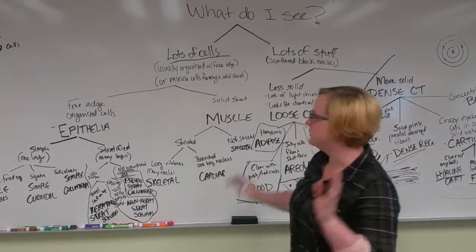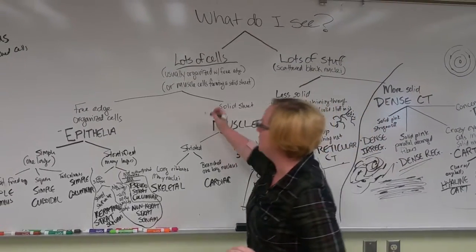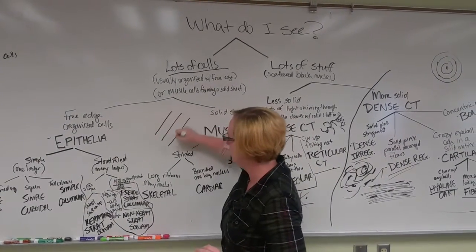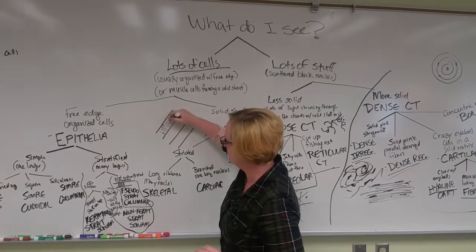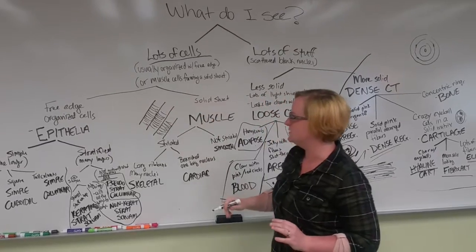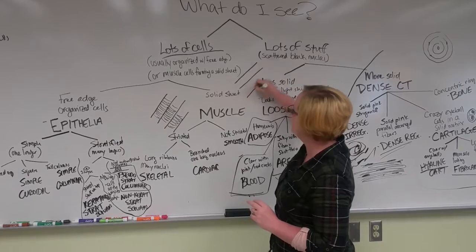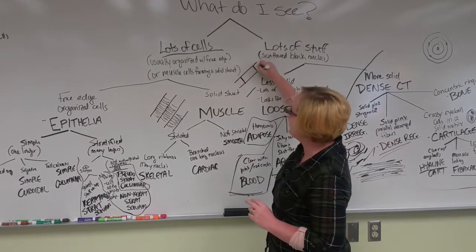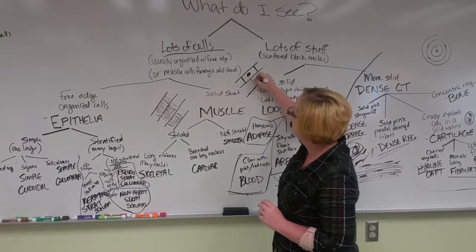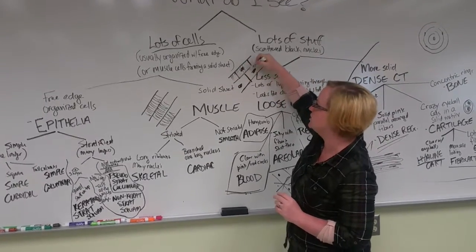For example, you could look in a microscope and see something that's very solid in pink color, but clearly divided cells from one another. You'll see clear ribbons like so, with striations that go across, like that. Or you'll see something very similar to that, where you'll have these ribbons going across, but they're more branched and segmented from one another, and they have a big nucleus in the center. Okay? And again, you're going to see clear striations.